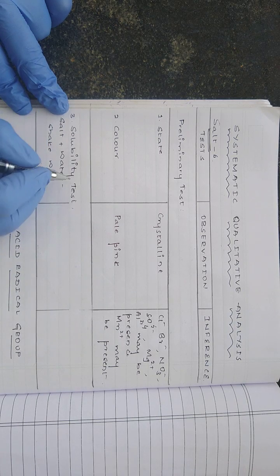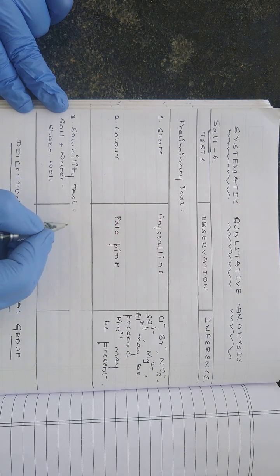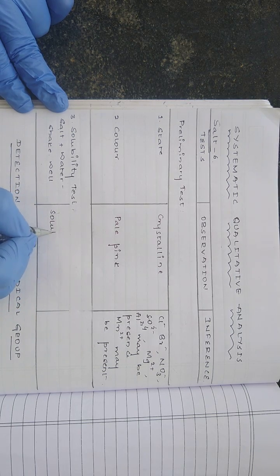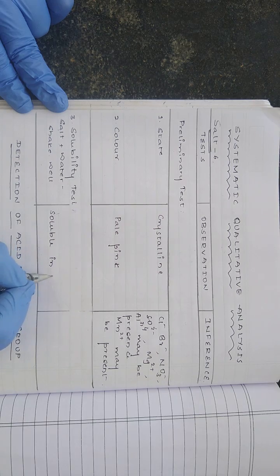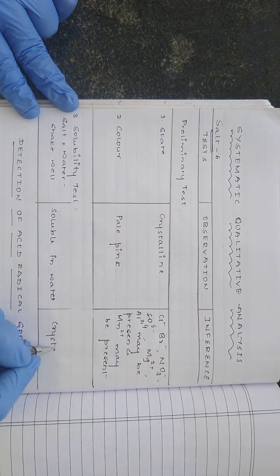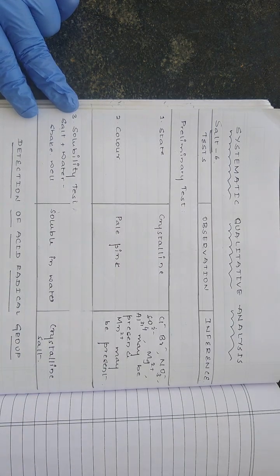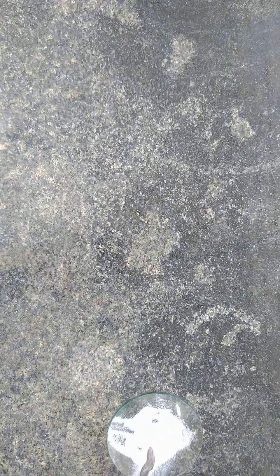Also we have conducted the solubility test. How to perform that? Salt plus water, shake well. The observation that we got is soluble in water, so the inference is crystalline salt. Then we will go for detection of acid radical group, that is group 1, and the name of the test that we are going to perform is the dilute sulfuric acid test.